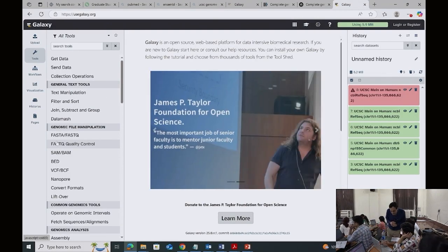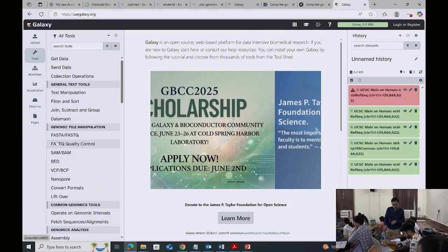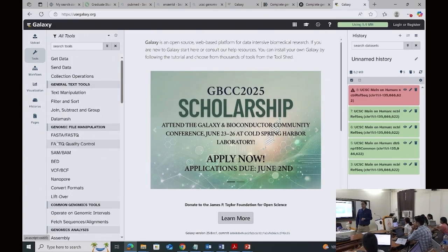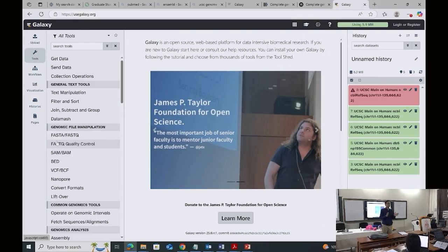Oh, you are getting the error in coding as well as whole genome. Oh, you are not able to get it. Oh, in both. But you were able to get to step number 3, the intersection step. Okay, yeah, try it some other time. Go through the screenshots. You should be able to do it.